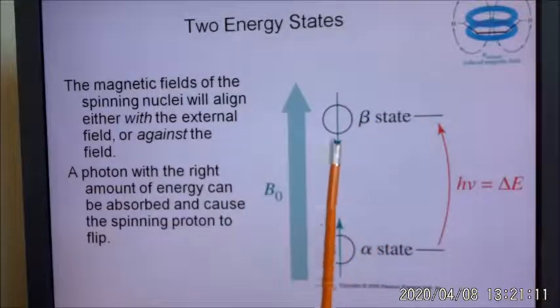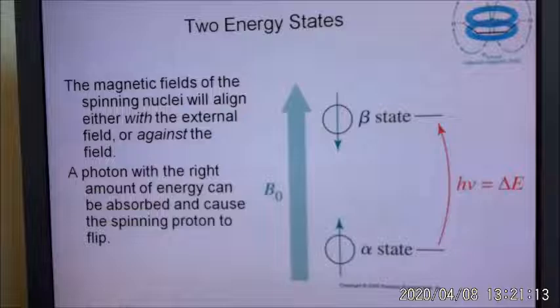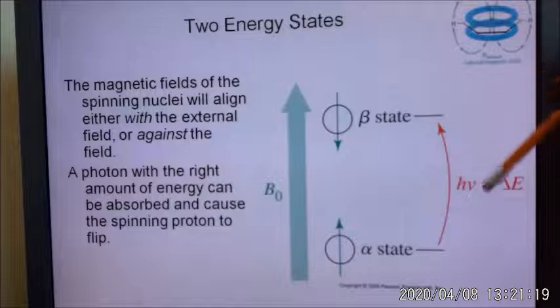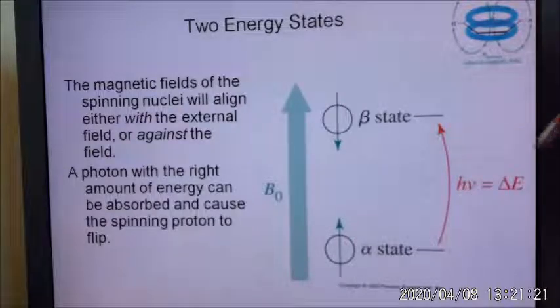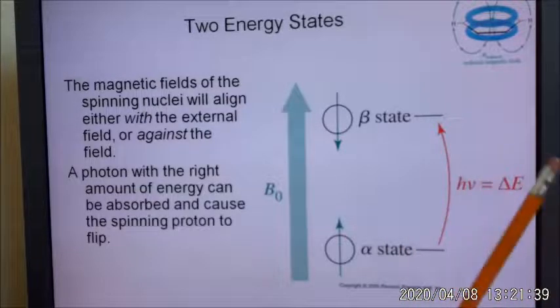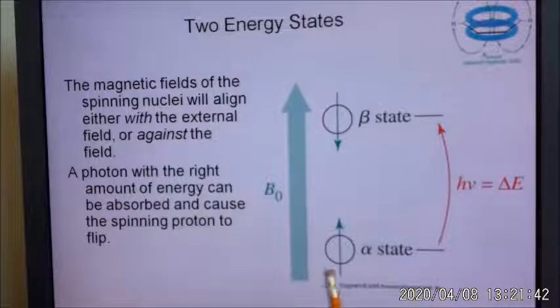That's an absorption. And so when we do NMR initially, the continuous wave, which I'll discuss, we're looking at what frequencies my protons absorb energy to go from the alpha state to the beta state. Now, as you know, when it does absorb this photon, it is in an excited state. And over time, it's going to relax, and it's going to emit that same amount of energy. So we can get an emission spectra as well from my proton NMR.